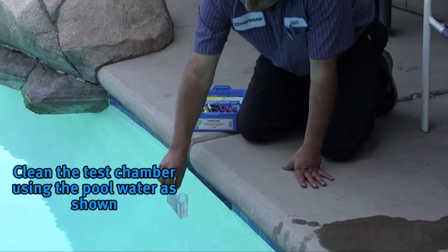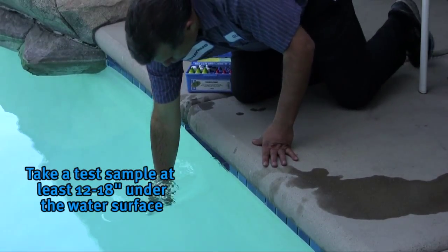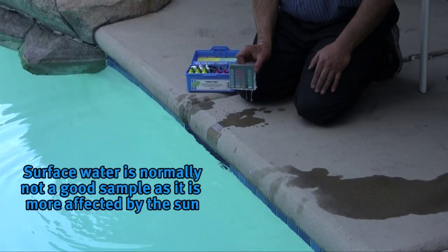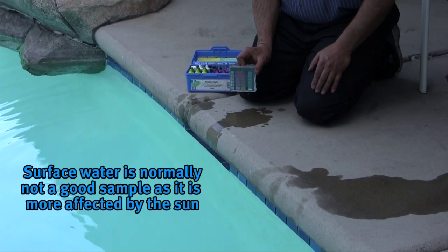When taking a test sample from your pool it is best to first clean the test chamber as shown, then take a sample at least 12 to 18 inches under the water's surface. Surface water is normally not a good sample as it is more affected by the sun.